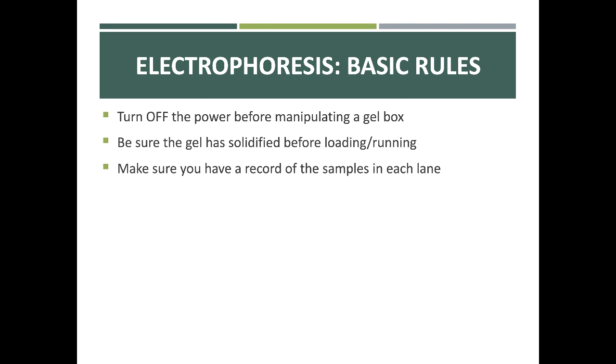It has you put in the notebook, the electronic notebook, the order of the samples that you load. And it's important you do that correctly, because if you do it incorrectly, it will show you the wrong results, much in the same way as if you did not load it correctly in a real lab.